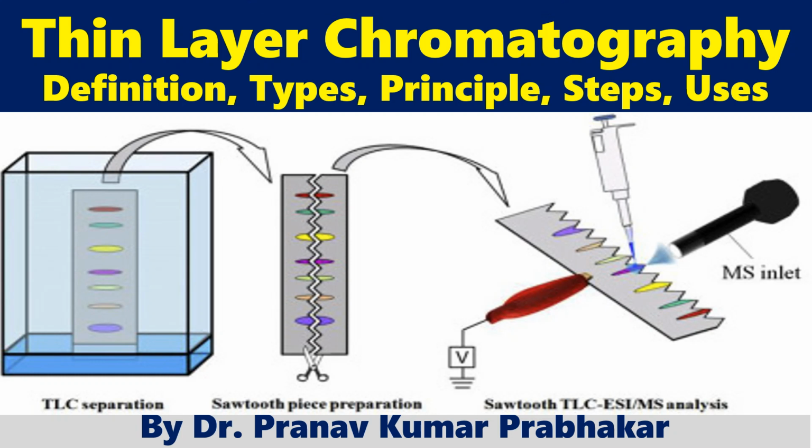Today I am going to talk about another category of chromatography, that is thin layer chromatography. Earlier I have uploaded a couple of videos on the basics of chromatography and paper chromatography. So this is the third video in this series. We will see thin layer chromatography, their definition, types, principle and steps and other details. Their applications, their merits and demerits we will also see.